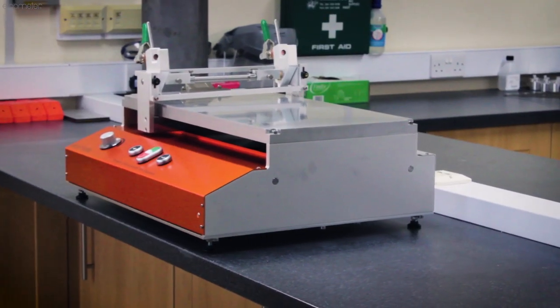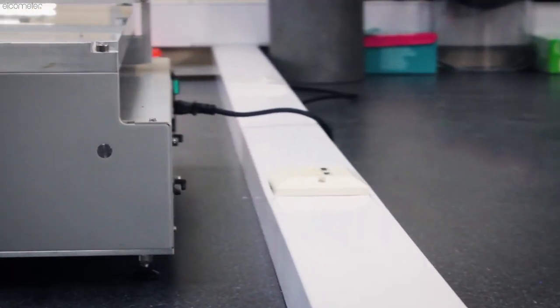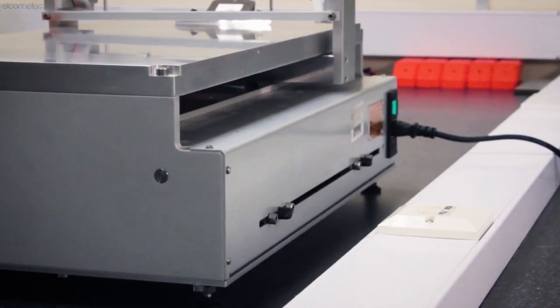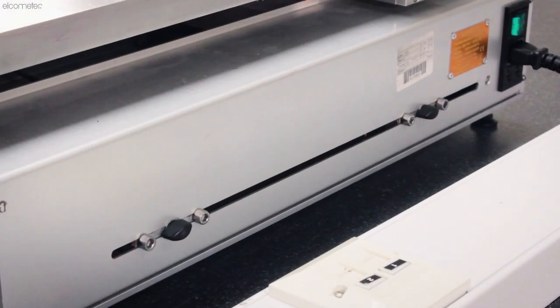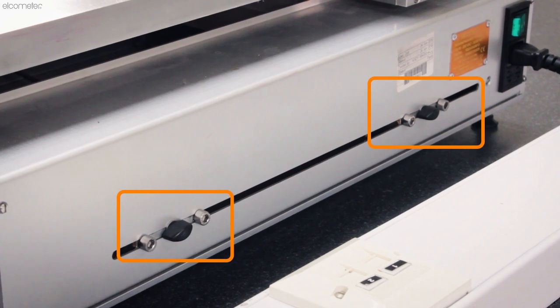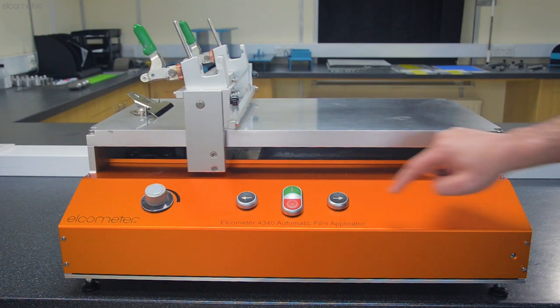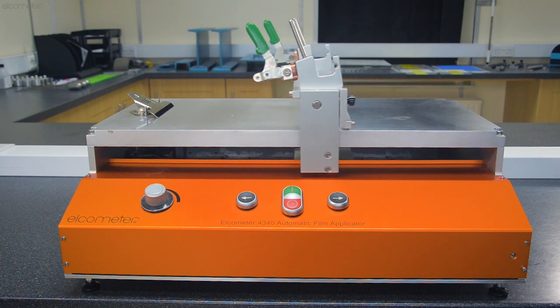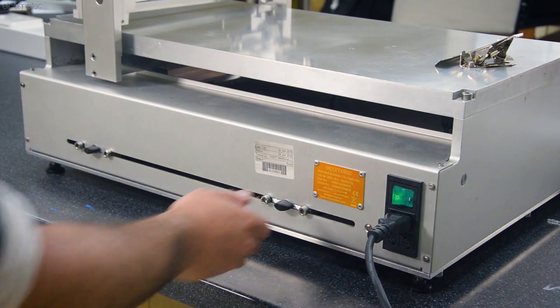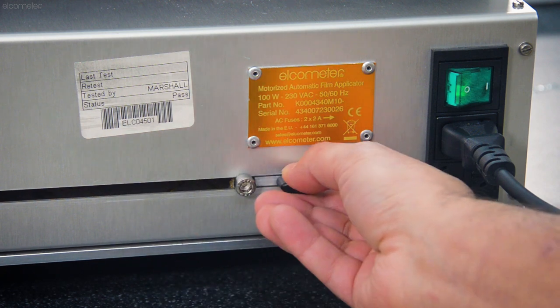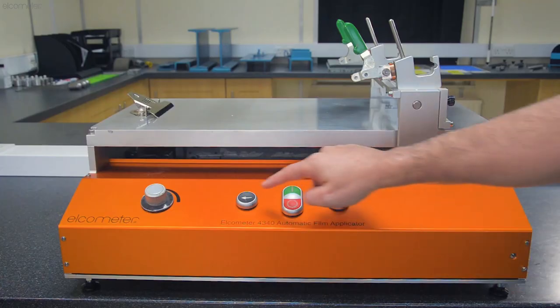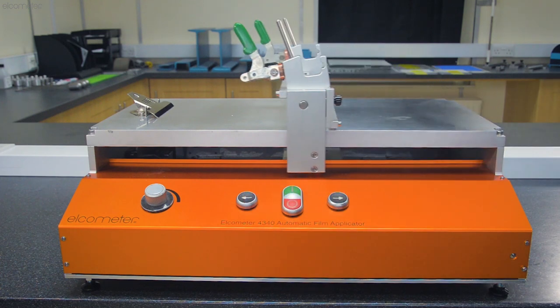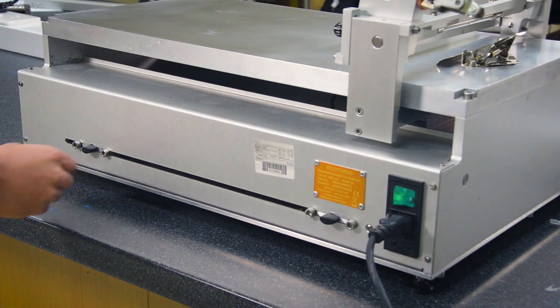With the speed set, you can now set the carriage start and stop positions, which defines the length of your film. This is set using two knobs on the back of the machine. To adjust the start position, press the carriage start button and the carriage will move to the end position. With the carriage now out of the way, unscrew the starting position knob, adjust its position, and retighten. To adjust the stop position, press the carriage return button, which returns the carriage to the start, and then adjust the end position knob as before.